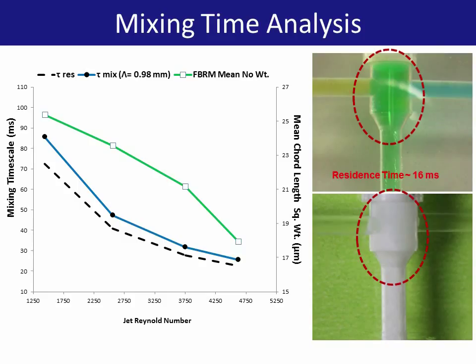This finding highlights the importance of reliable measurement techniques, as despite the fact that non-ideal two-phase flow and imperfect mixing were found to occur, the in-situ application of PAT provided a fast and robust method for an empirical design that can easily account for non-ideal system behavior. As outlined already, the small volume of the system and the rapid attainment of steady state may even allow for empirical optimization at scale.